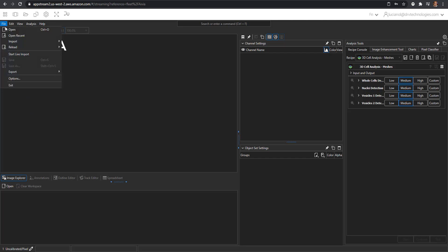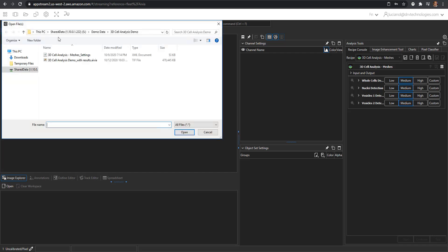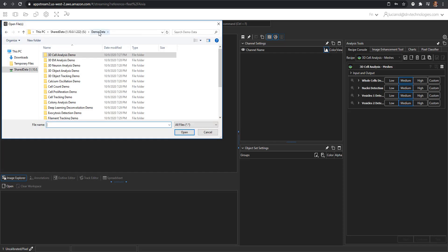Go to file, open, navigate to the demo folder, demo data folder. In there you will find the 3D object tracking demo.